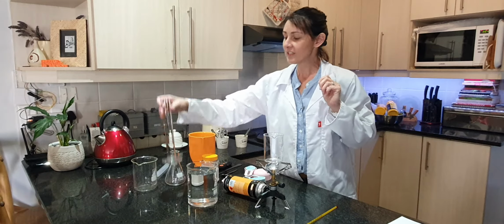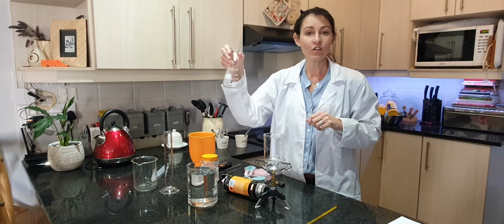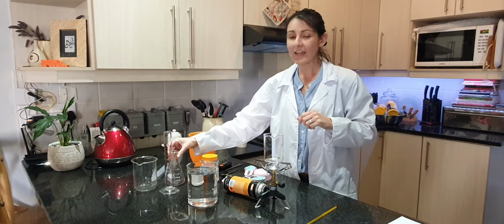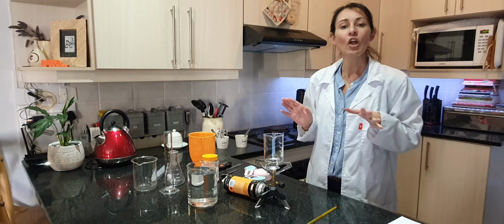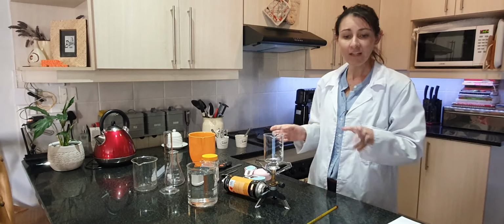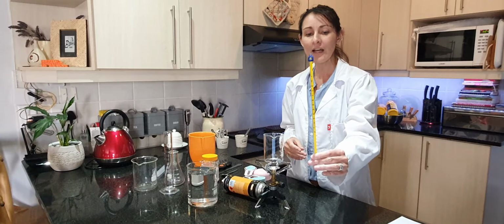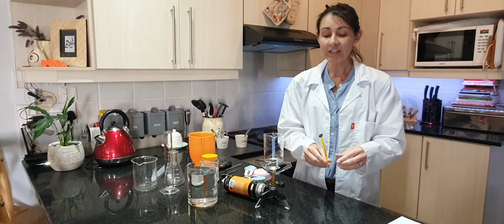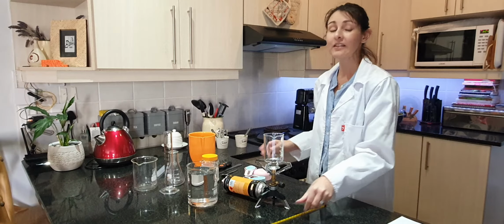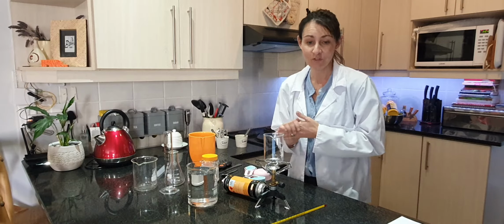Then also this is a measuring cylinder, and this is a conical flask, so we can actually use any of these as long as we stick to the amounts that your practical requires. Then we need a thermometer, so that we can take the temperature of the substance that we are going to heat up today.